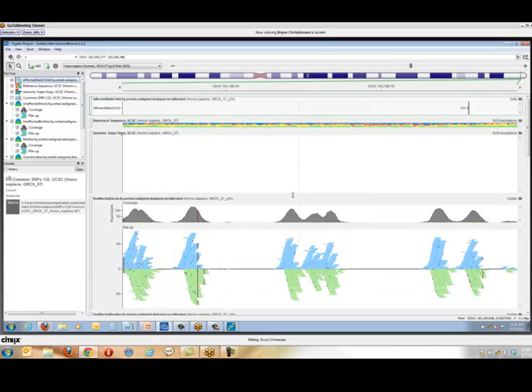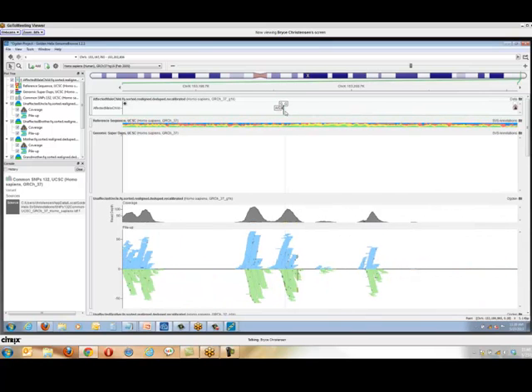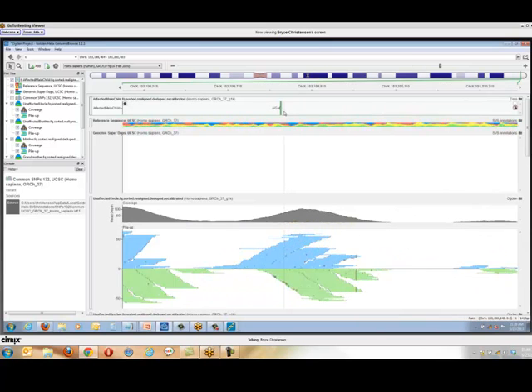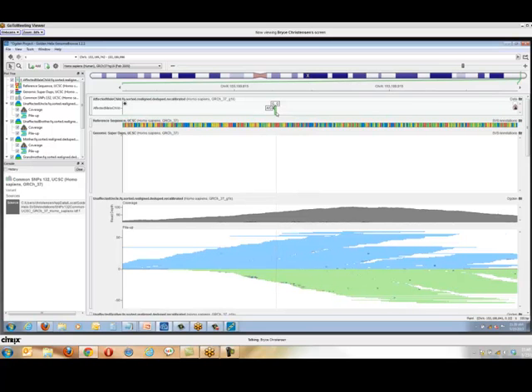That's okay. So I have up here at the top a track that represents all the variants called in that gene in the VCF file for the affected male child. It looks like there's only one variant in the child at all. We can zoom in here around it a little bit closer, and then we can kind of go down the way.